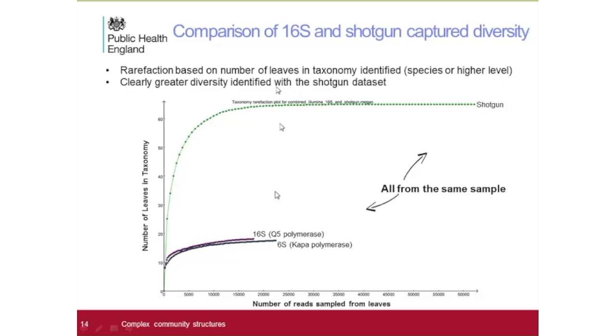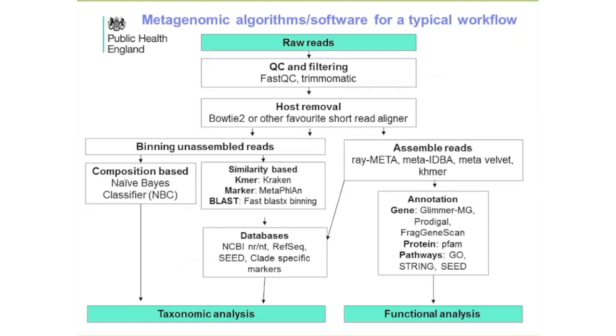And as you can see, you have an increase of 3-fold of resolution of the diversity within the sample using shotgun. So that's just to give you an indication of what is the limitation between both methods in the number of species or improving the diversity within any sample.